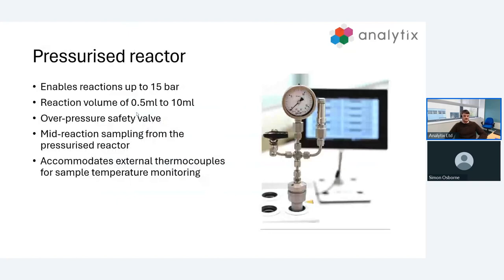This is our pressurized reactor. This enables reactions up to 15 bar. It's handy for reactions that need a little bit of help and pressure to occur. We have a reaction volume of 0.5 mils up to 10 mils, and we have an over pressure safety valve on the right. This will safely release excess pressure. We have a small inlet there for mid reaction sampling, so even when it's pressurized we can sample from this and analyze your reactant mixture. Using a three-way valve, we can also accommodate external thermocouples to measure your actual temperature of the sample mid run.